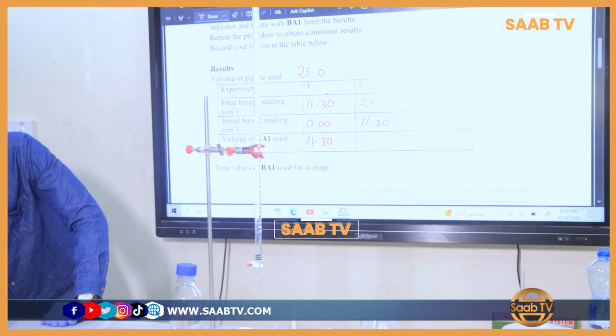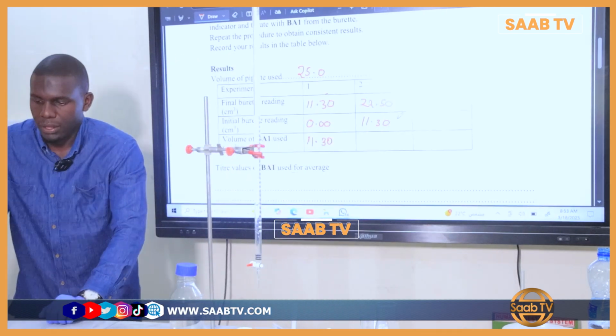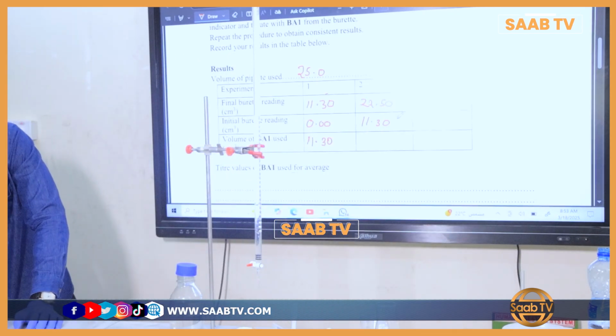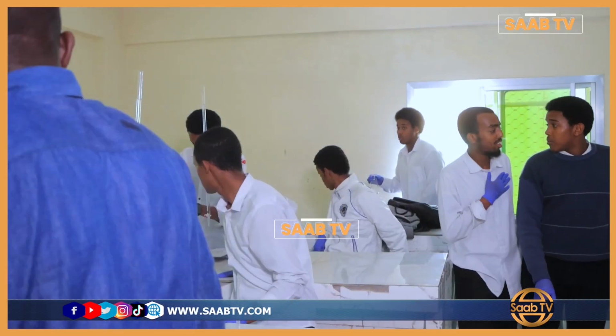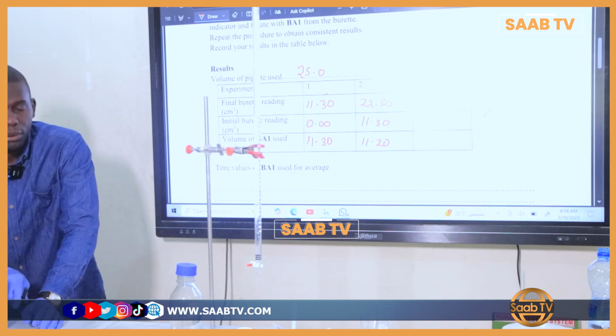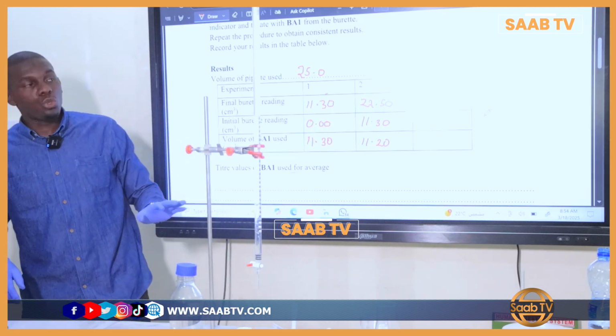22.5, that's the final reading. So what will be the volume of the BA1 used? It is 11.20, very good. Now, I'm not going to begin at 22.5 again.